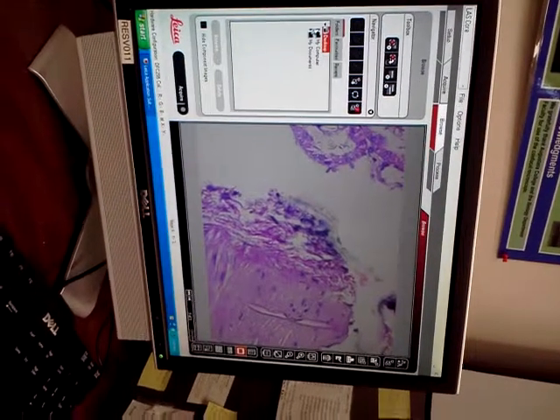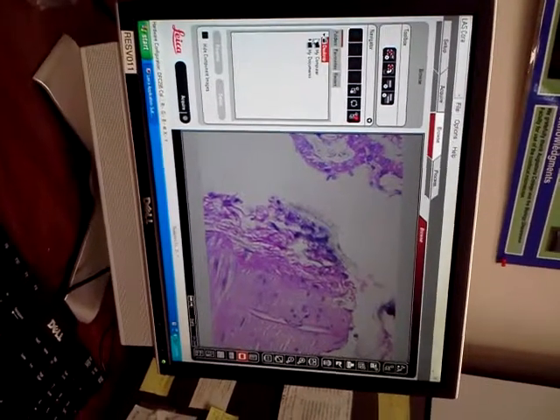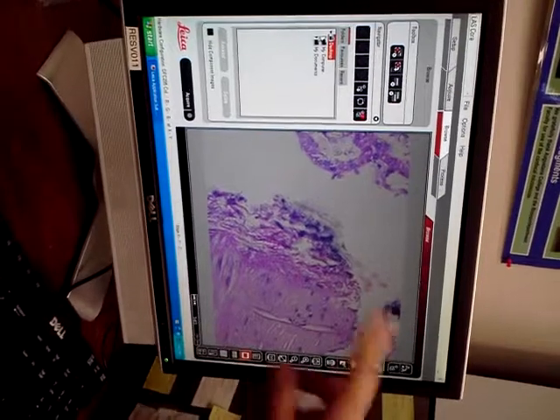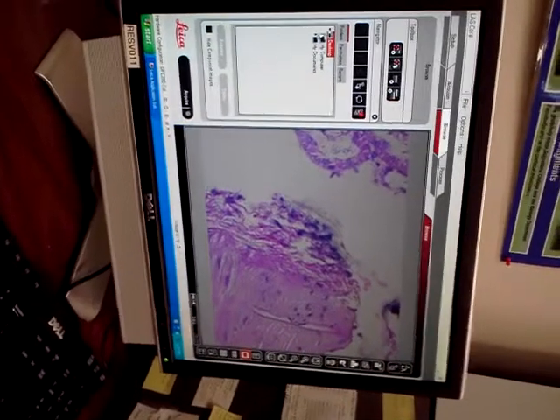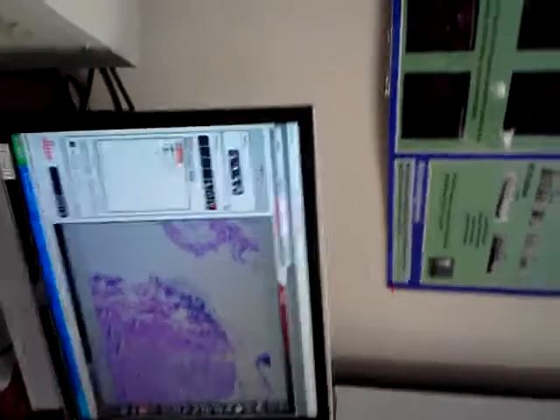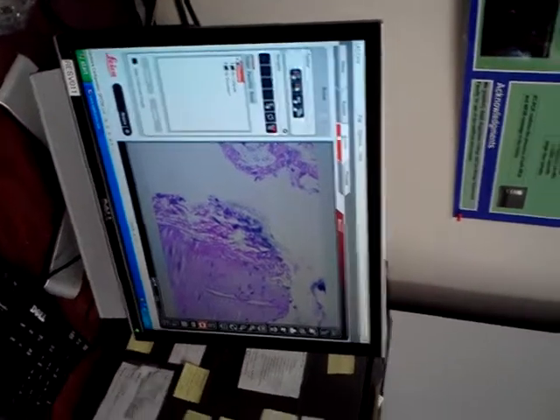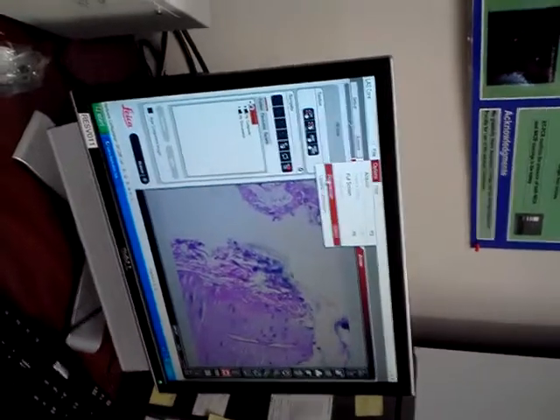Whenever you're deleting, moving, saving anything, do it within the software, not through Windows. Did you hear that, Leah? Whenever you're deleting, saving any of these files, do it within this software, not within Windows. Now, when you watch the video, you'll hear that twice. We'll emphasize that. Actually, I'm going to take that back.